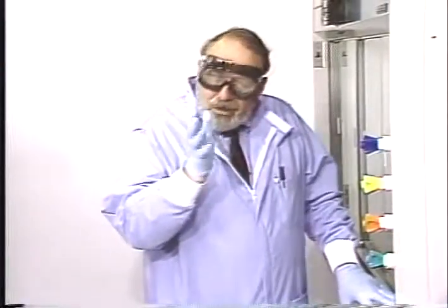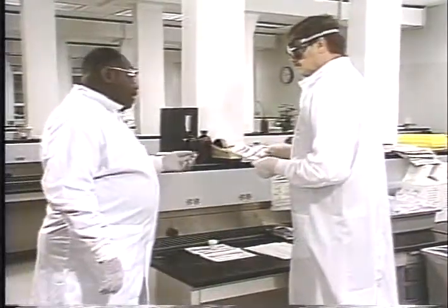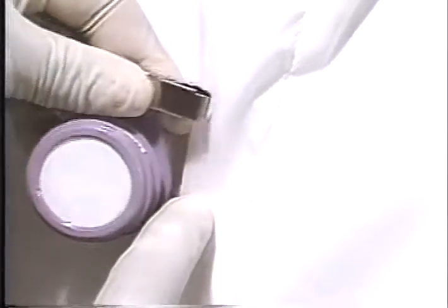Those are some of the health hazards associated with the mishandling of formaldehyde. Let's take a look at ways to protect ourselves from these problems. We need to monitor the amount of formaldehyde that we're exposed to. Employers will test the air in our immediate work area by taking individual samples. They'll compare the test result to OSHA's new permissible exposure limit for formaldehyde, a figure expressed in parts per million.